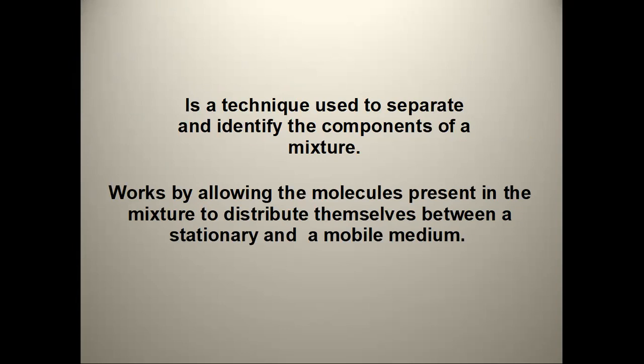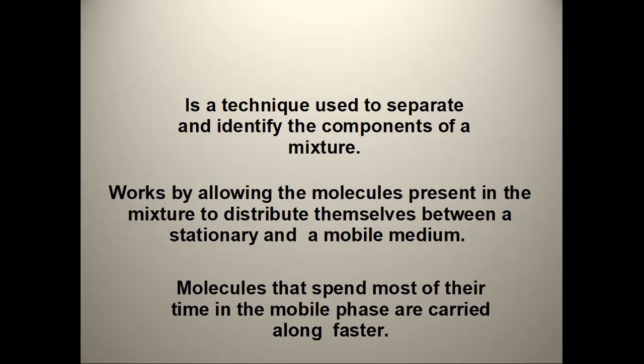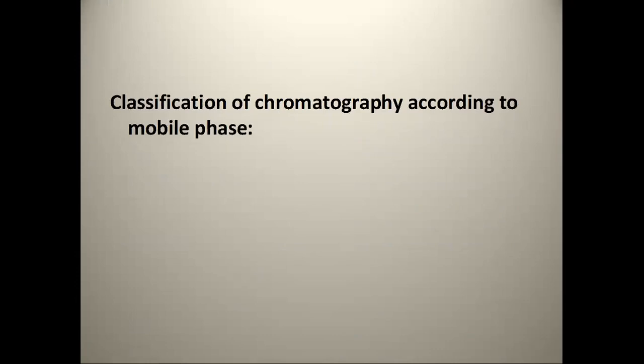So the intermolecular interactions of each molecule in the mixture will be different because they will interact differently with the solvent and they will interact differently with the paper itself. So molecules that spend most of their time in the mobile phase are carried along faster. Okay, so that's chromatography.